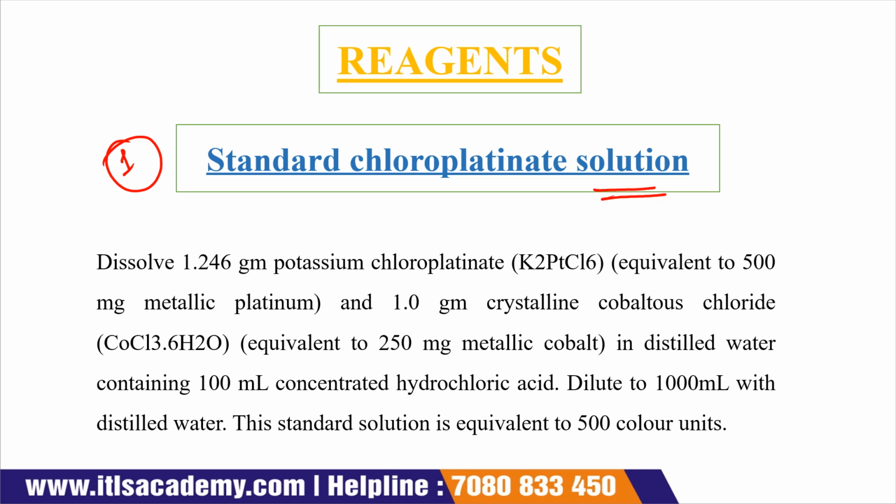For this, we take 1.246 gram of potassium chloroplatinate. Suppose that this is your beaker.